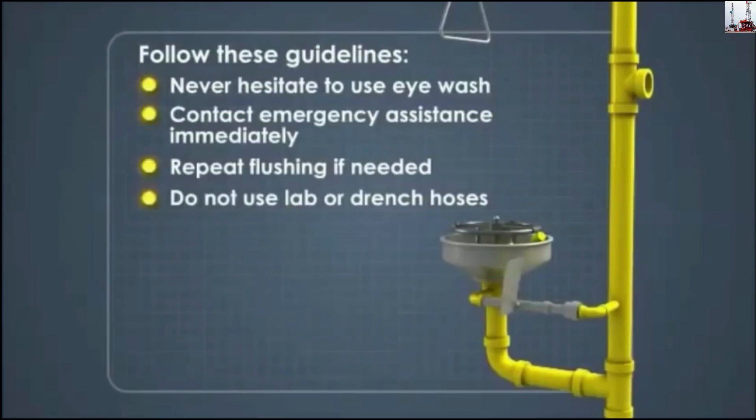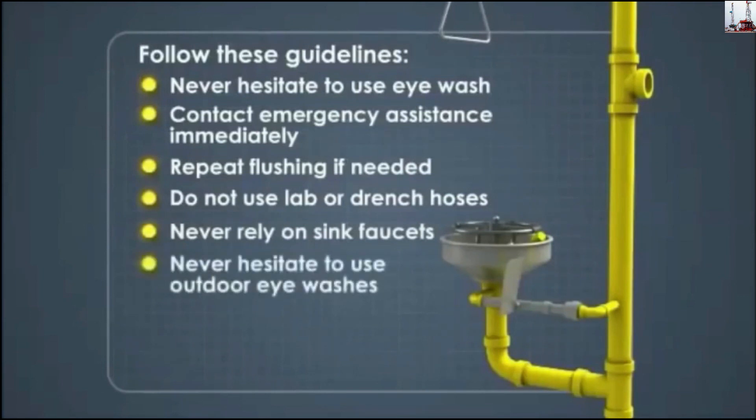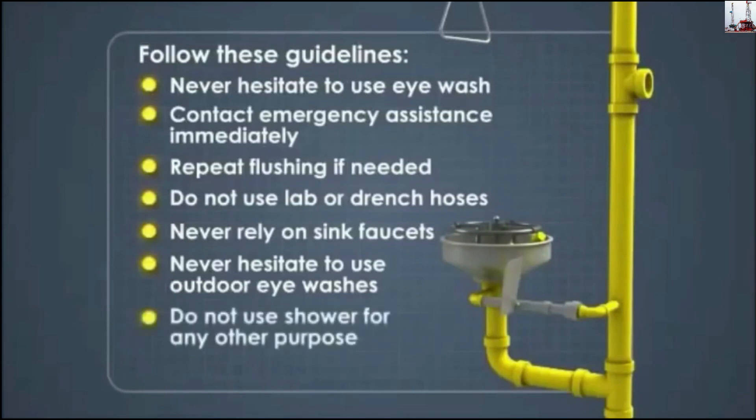Do not use lab or drench hoses as an eyewash — these hoses are typically used for cleaning and may not be sanitary. Never rely on sink faucets to replace an eyewash. Some outdoor eyewashes may run discolored water for a few seconds; never hesitate to use them immediately when needed. Do not use the shower for any other purpose that might inhibit its immediate use in an emergency, and beware of slippery floors during and after use.